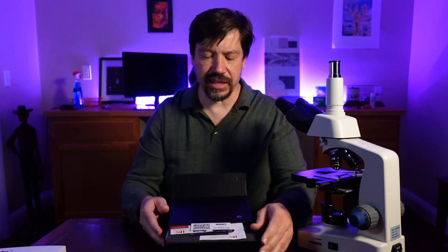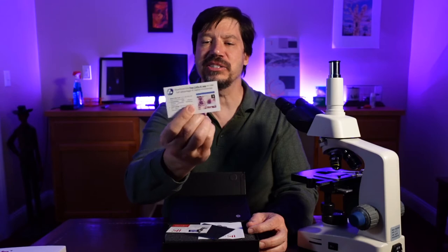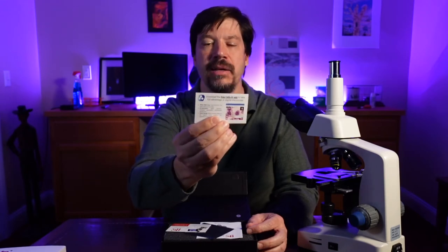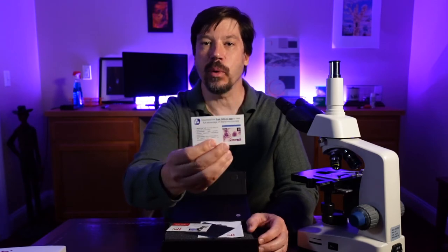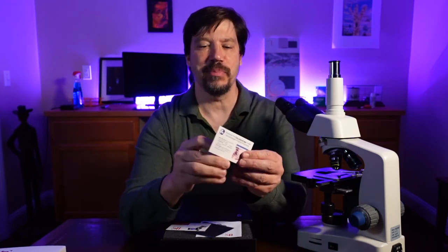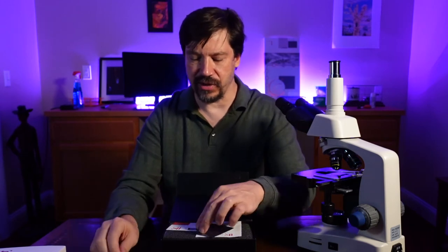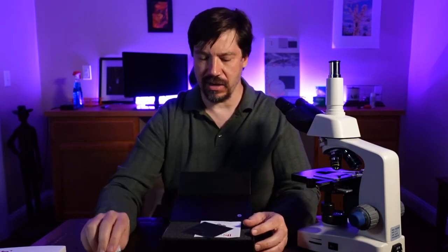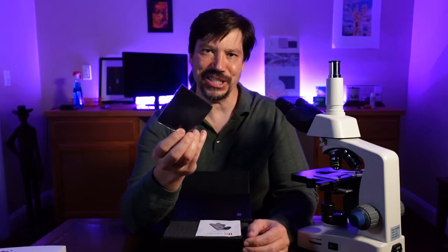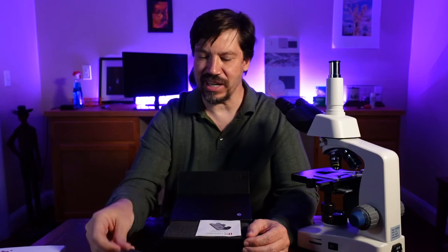Well, what's in here? First thing, we get some cards — this is a card for the software that comes with it. There's really interesting software: it uses artificial intelligence for pattern recognition, recognizing different cells and such. It comes with a little QR code so it's easy to download and apparently it is free. We also get a little LabCam card and a cleaning cloth. This is such a great business decision — it costs a fraction of a penny but it adds a feeling of luxury to the device.